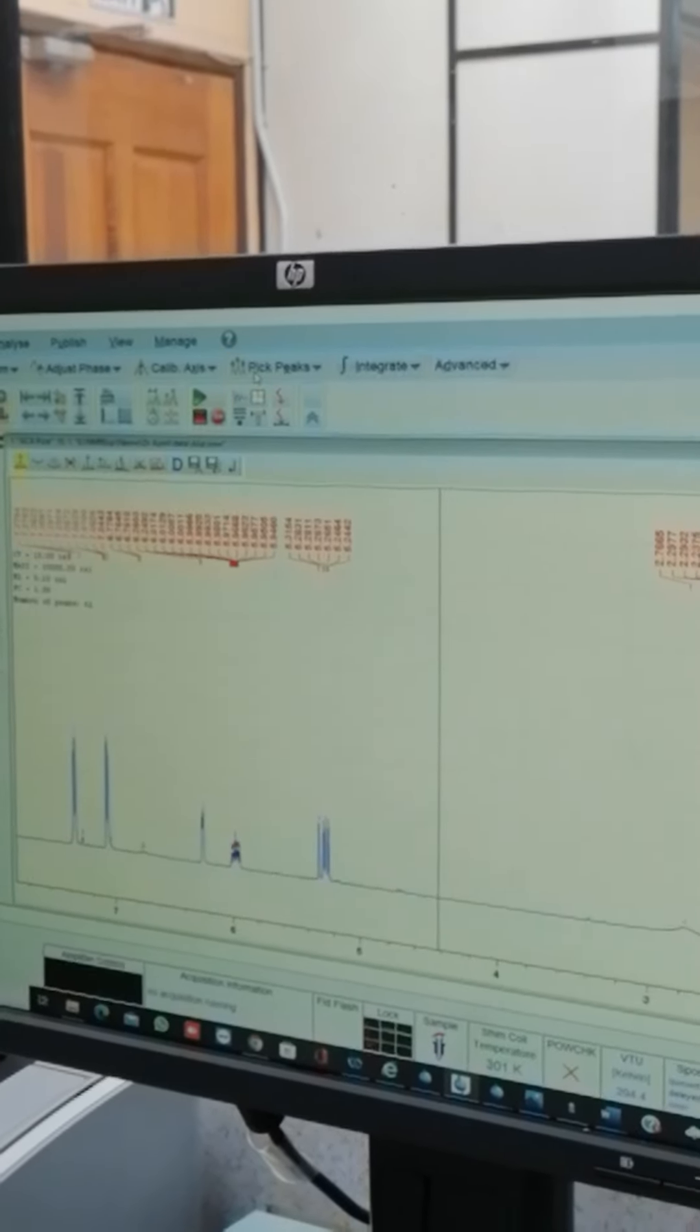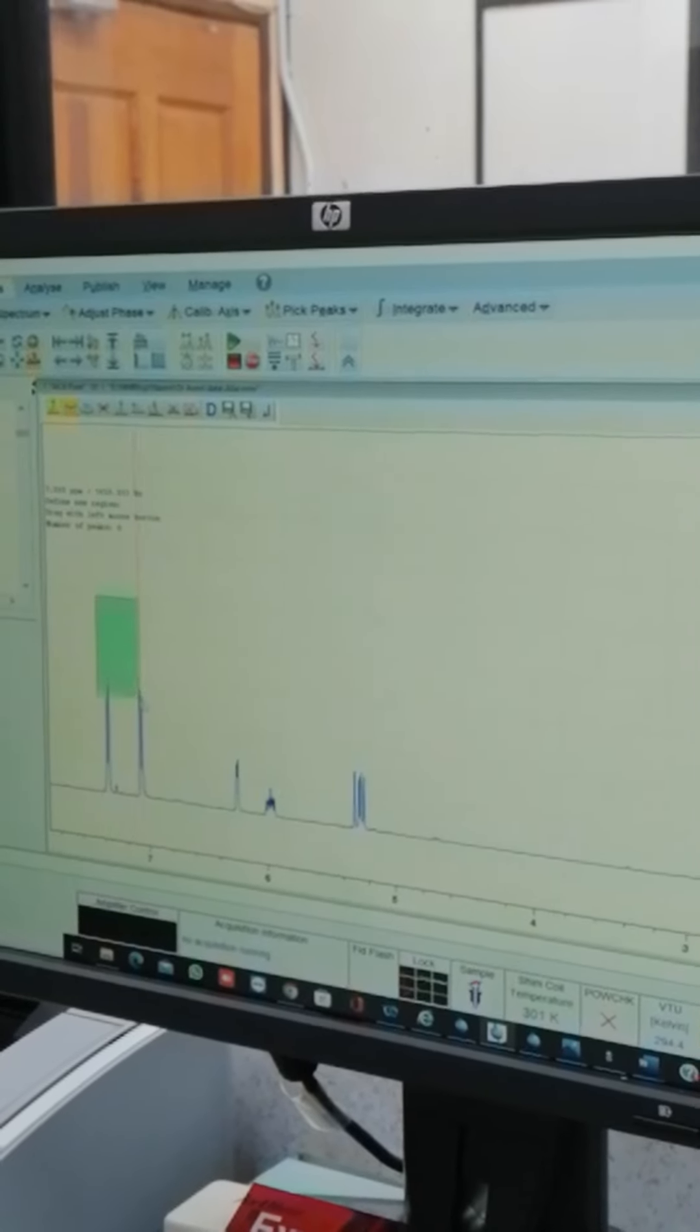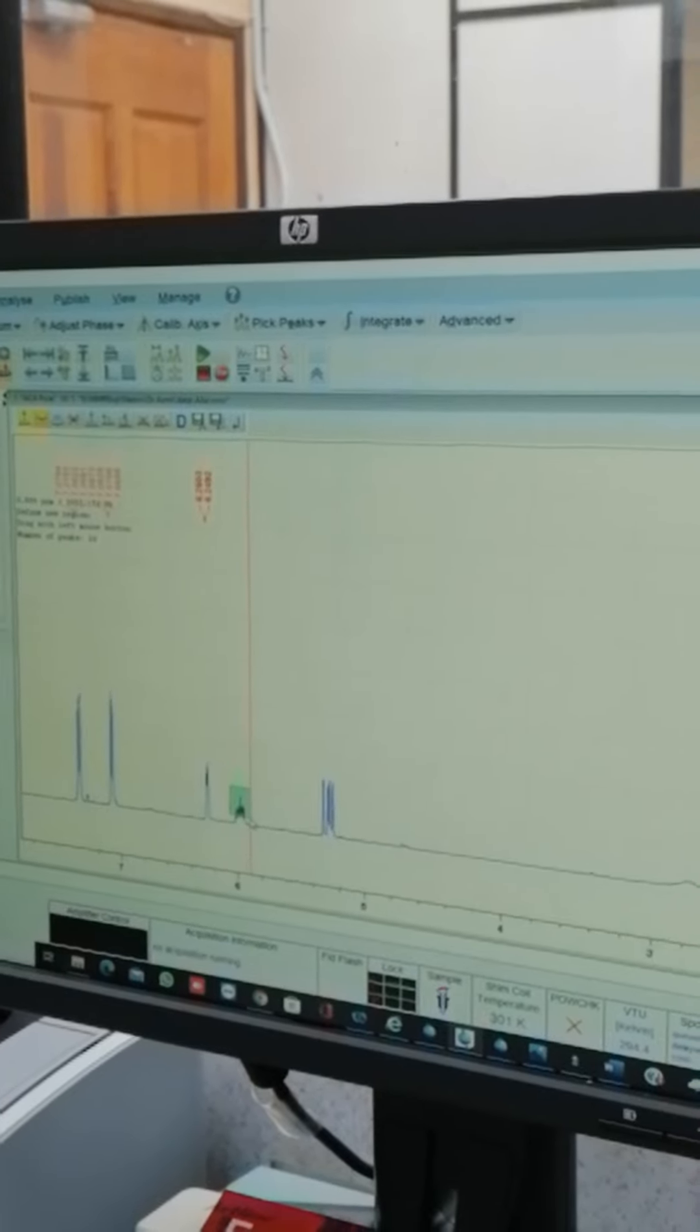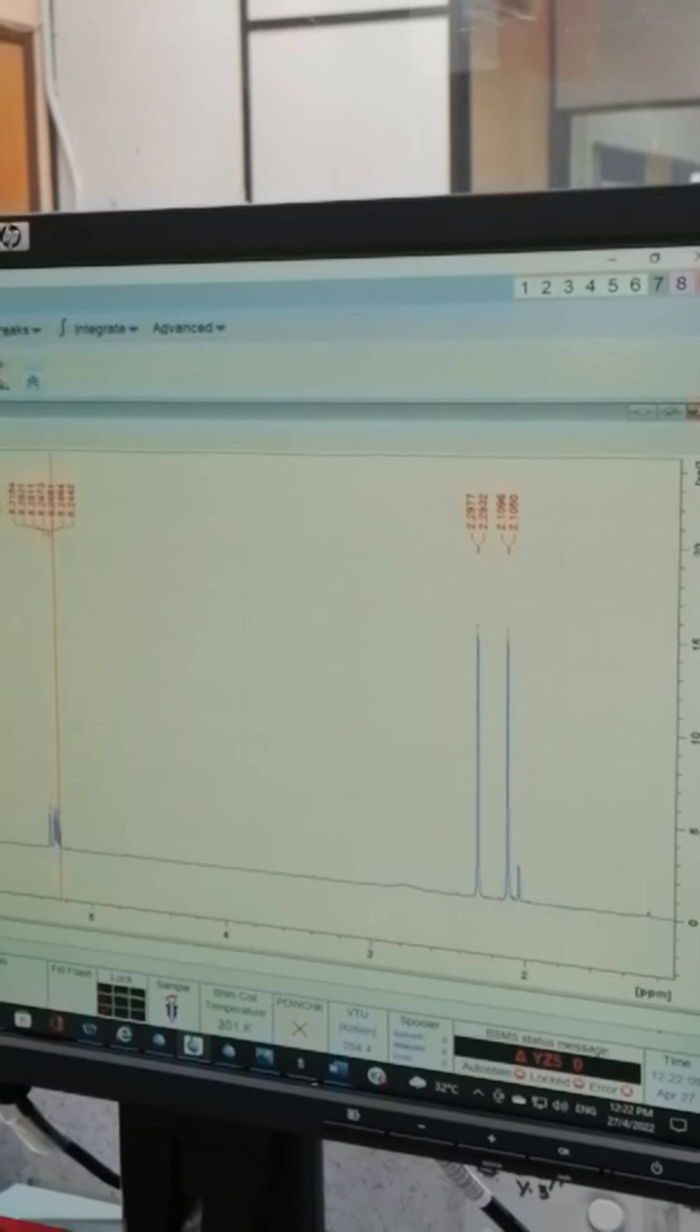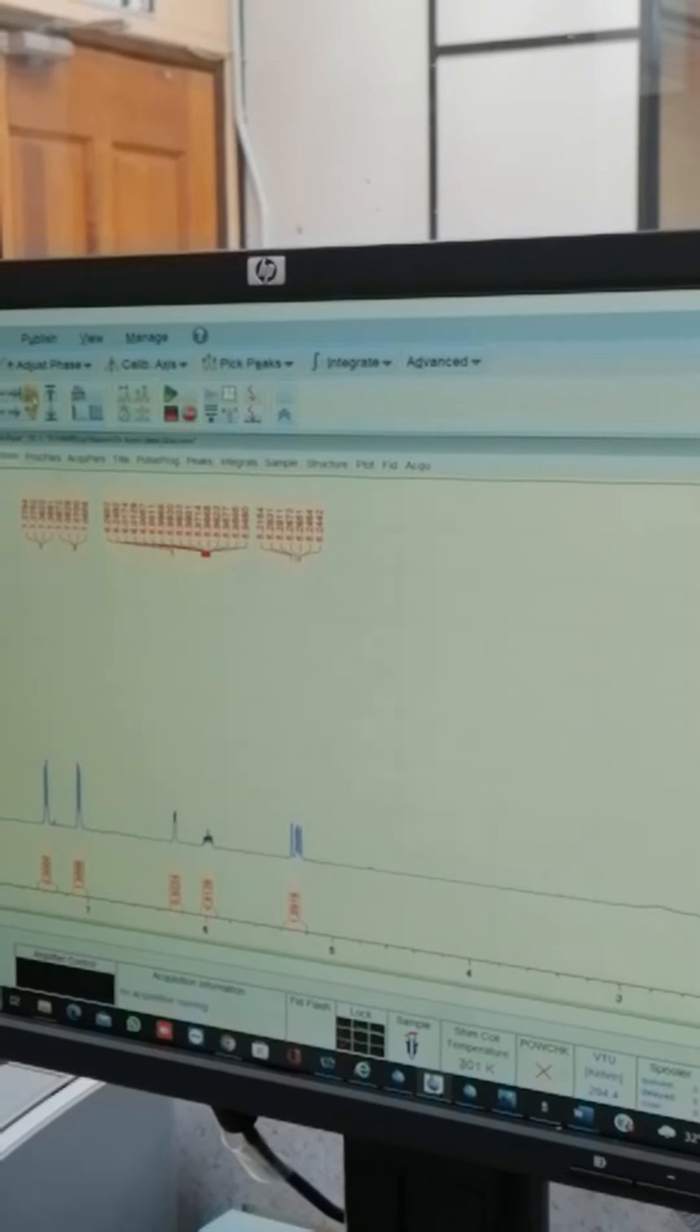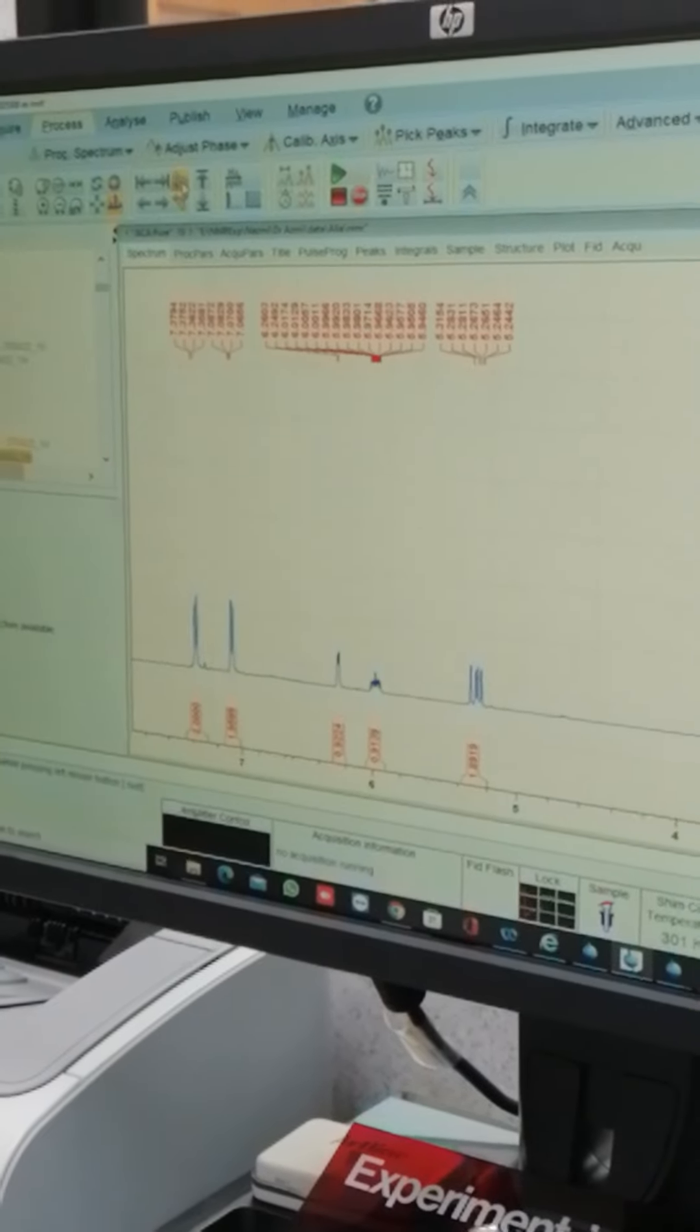And finally, we are doing peak picking. We delete everything. We are doing manual data. Thank you very much. Bye-bye.